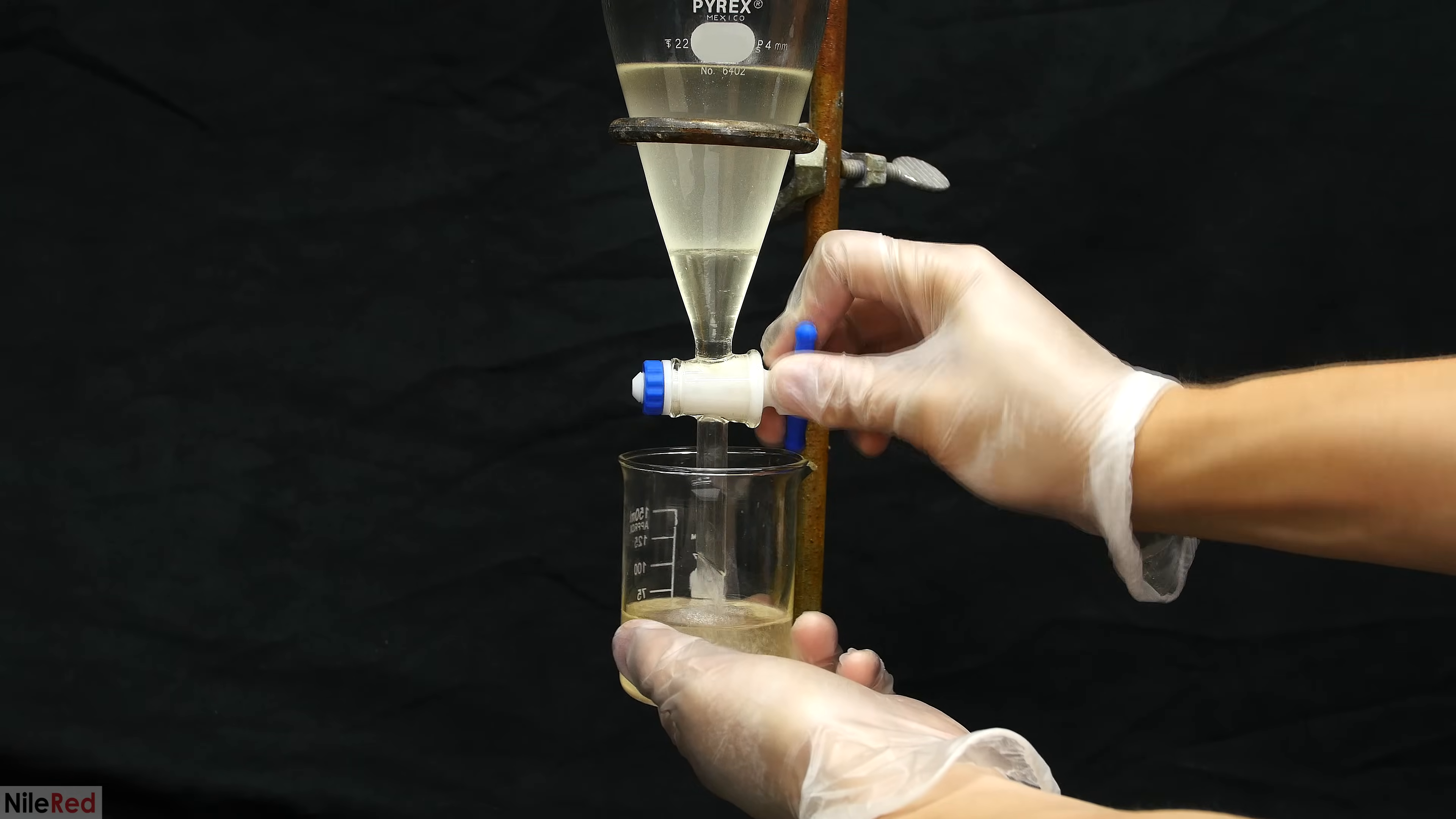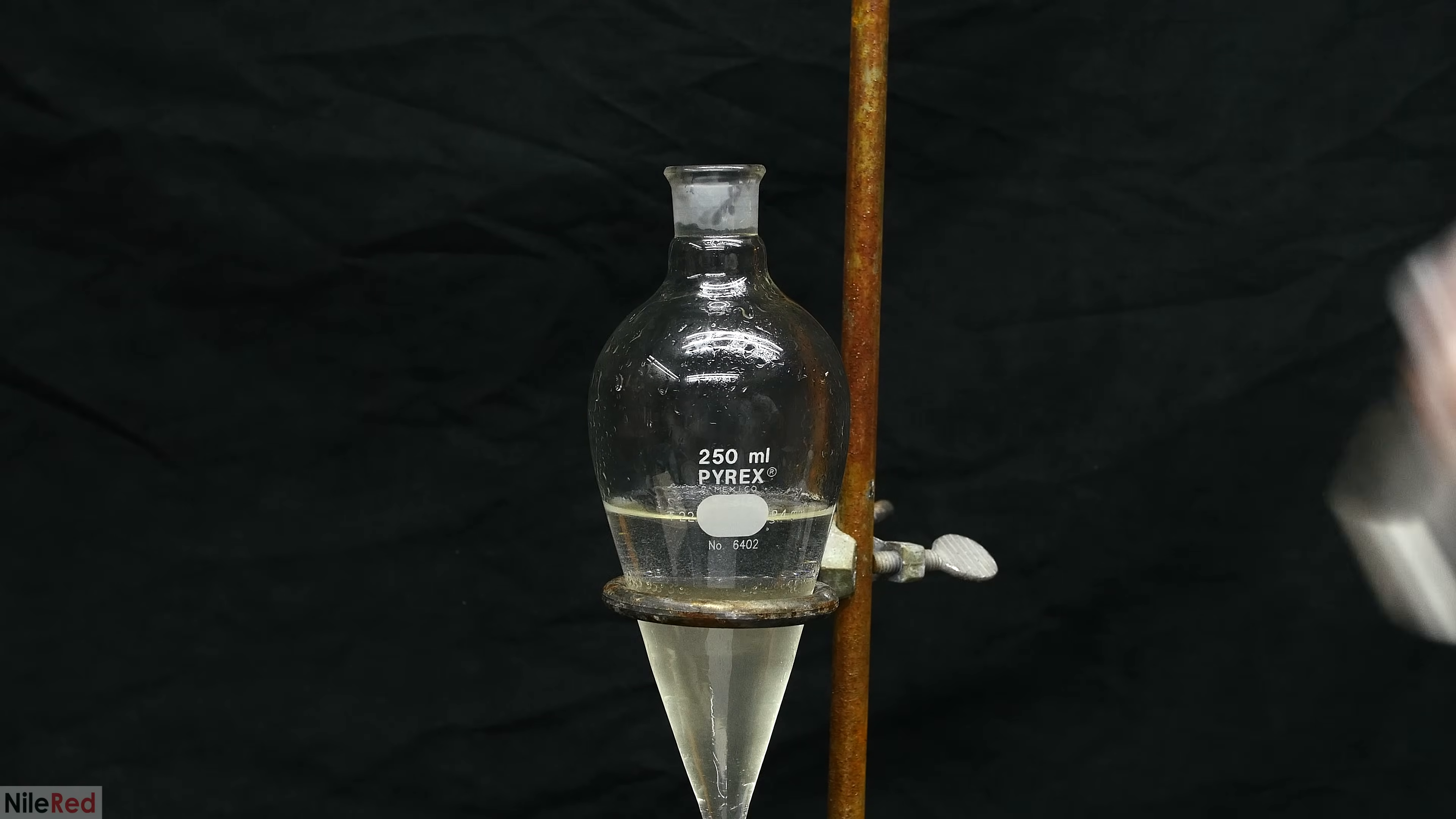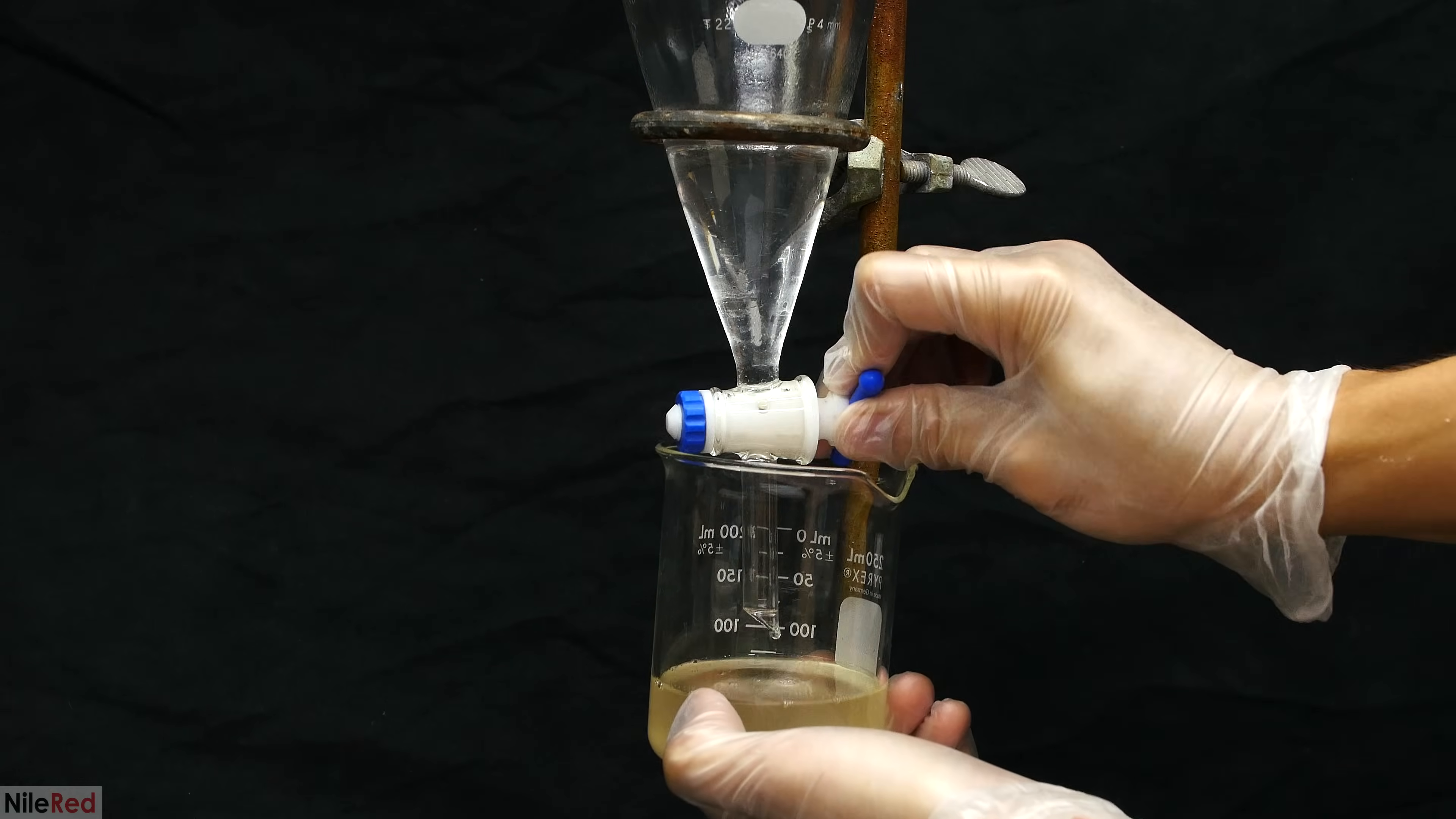Once the layers have separated, I drain off the lower DCM layer and I dispose of the upper basic aqueous layer. Again, the separatory funnel is cleaned, and I pour back in the anisole DCM solution. On top of this, we add in 50 milliliters of water. The purpose of this step is to wash out any phenol that still might be left behind. Phenol is much more soluble in water than it is DCM, so it should migrate to the water layer. After the layers have separated, the lower DCM layer is drained into a beaker. The DCM layer here is a little bit cloudy due to the presence of water.